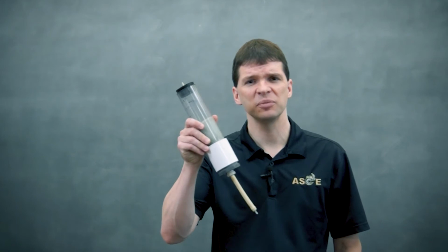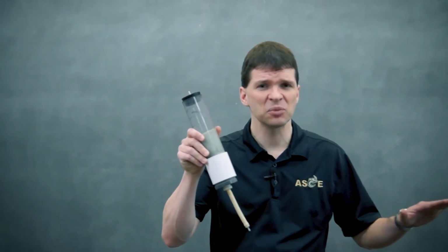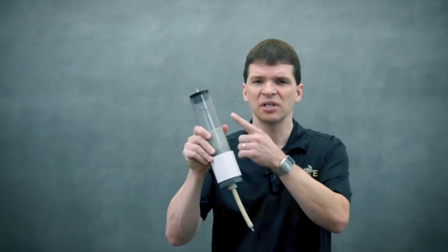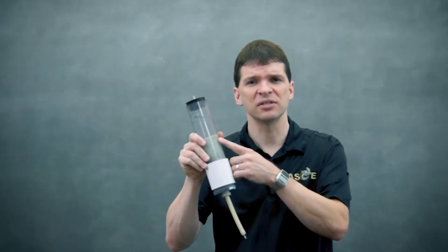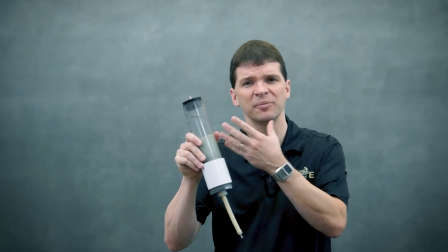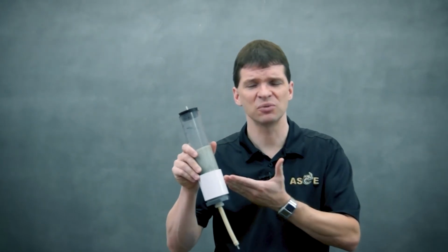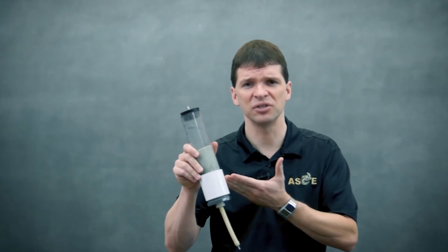So if you have a granular media filter, instead of a membrane filter, instead of a jar for sedimentation, you can actually use the same treatment process that the plant's using, and you can optimize the same treatment process with the same coagulation process to get results that are ideally suited to your plant.